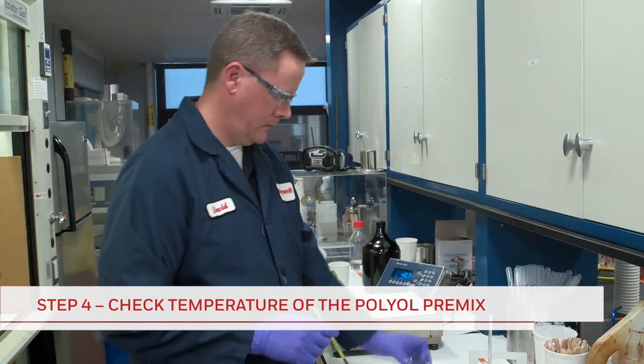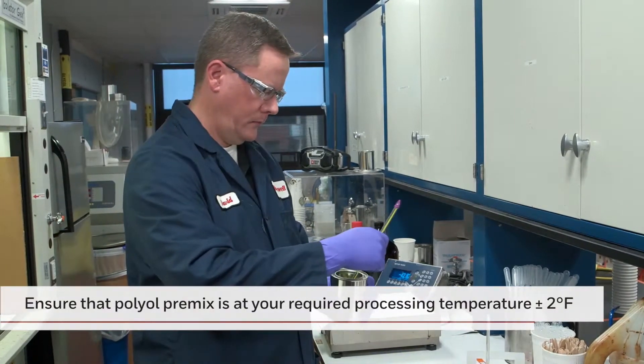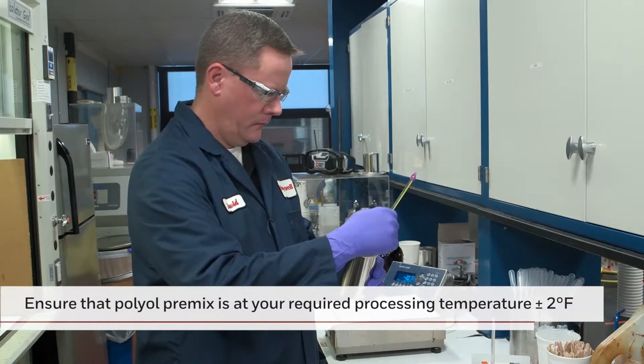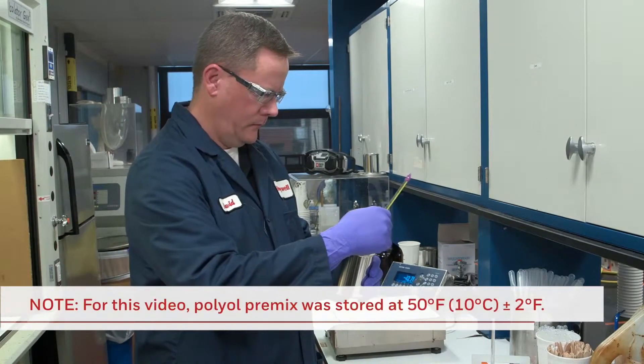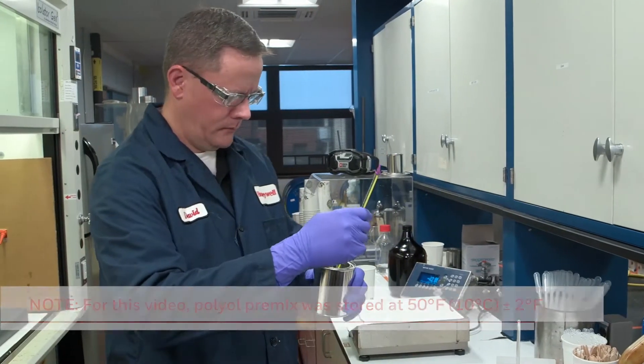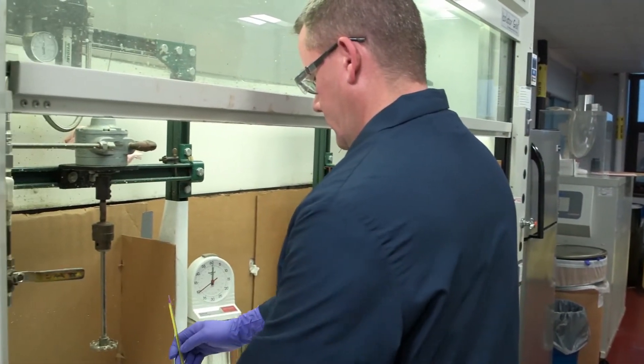The temperature of the polyol premix is checked to ensure that it is at your required processing temperature, plus or minus 2 degrees Fahrenheit, as differences in temperature can affect the resulting foam. For this video, the temperature target is 50 degrees Fahrenheit or 10 degrees Celsius. The polyol premix is then staged in the hood next to the isocyanate.